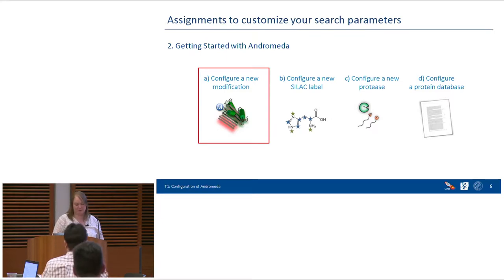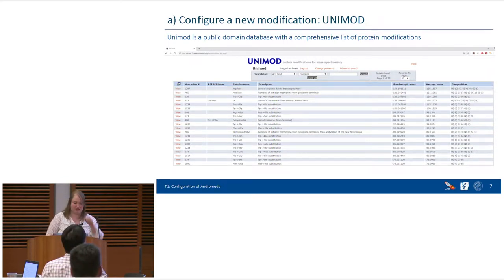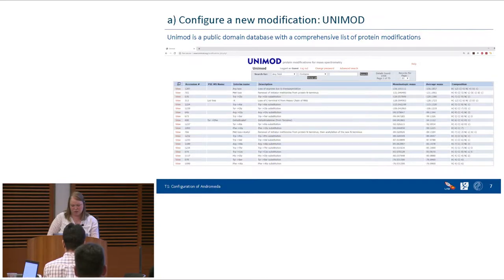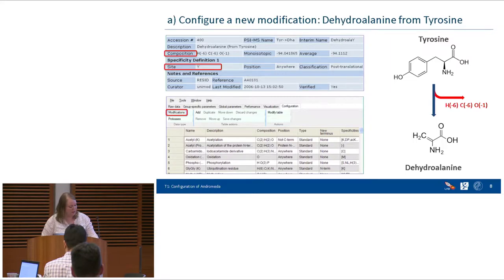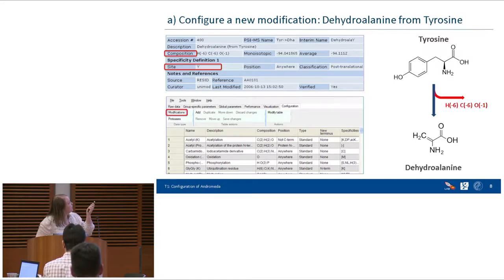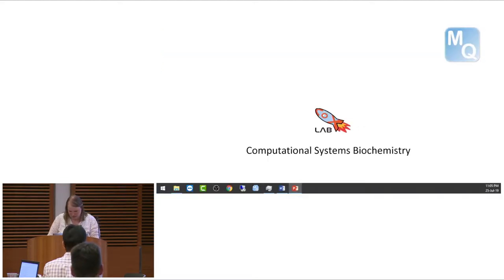Where do you get information about modifications? A common database accessible to everyone online is UniMod. Before we go there, I want to show you which modification we want to add. We picked one that hasn't been configured in MaxQuant yet — dehydroalanine from tyrosine. From UniMod you can find the composition of the modification, the site it sits on, and its name.